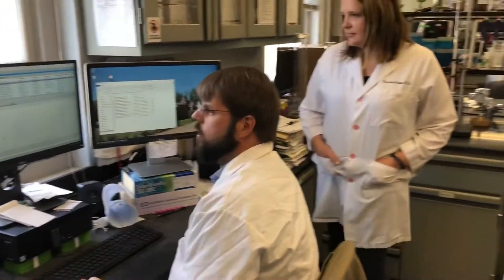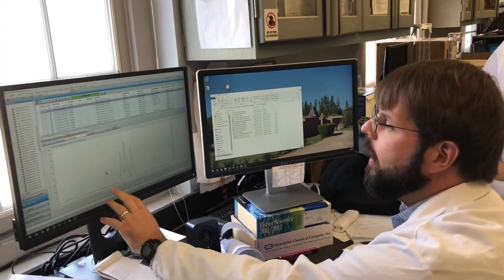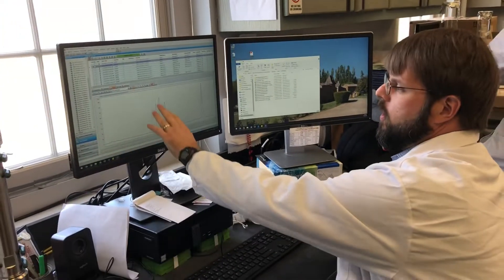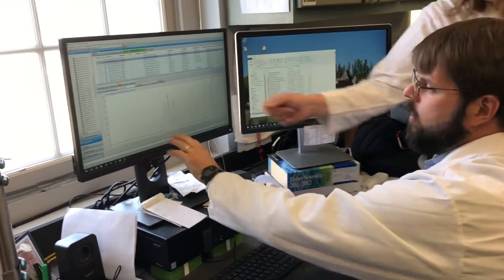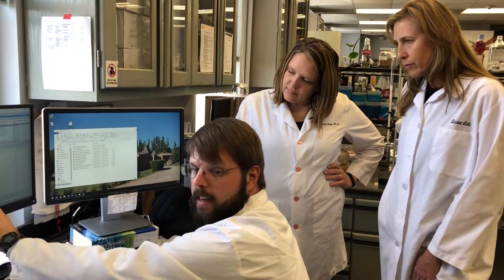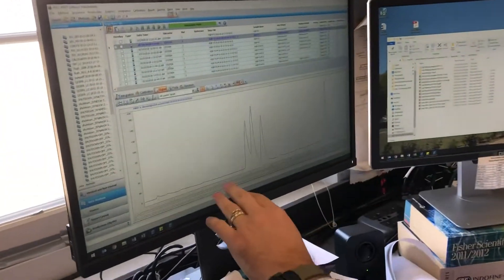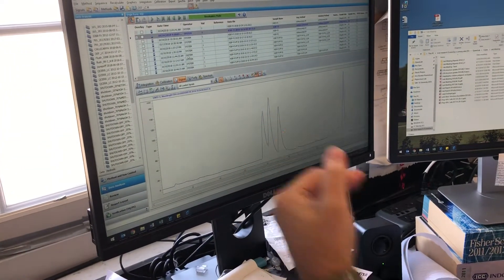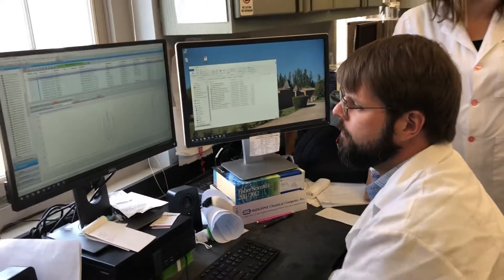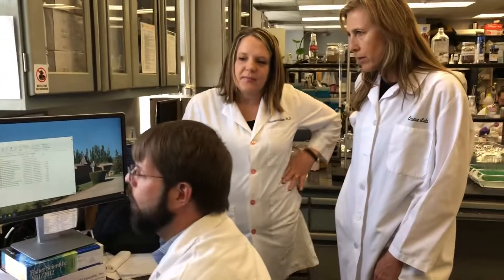This is the chromatogram at 254 nanometers. We're seeing the absorption of a single wavelength of light by the compound as it passes over a detector. The more that is absorbed, the higher the peak, and the higher the peak equates to more compound eluting at that time. So we're getting these compounds separated on more of an individual level.